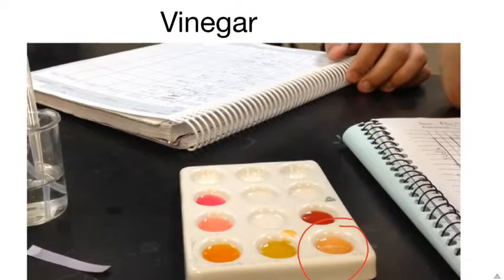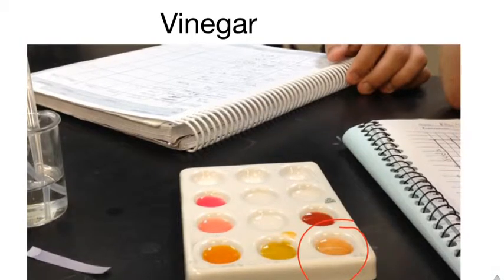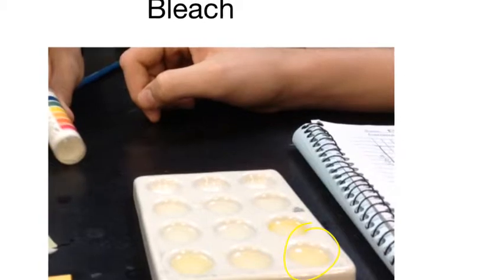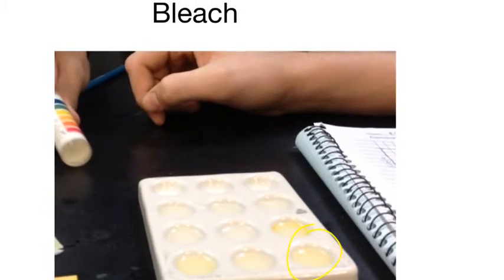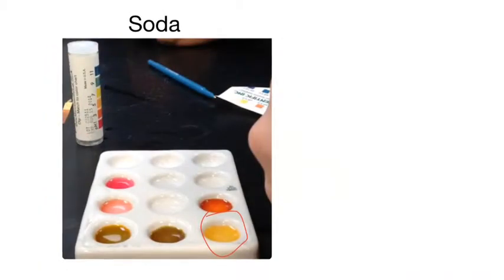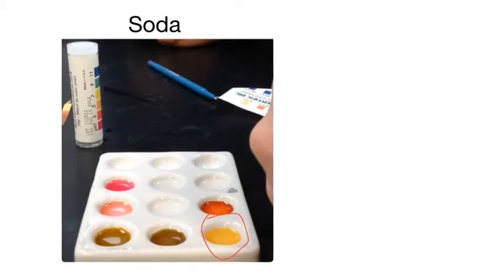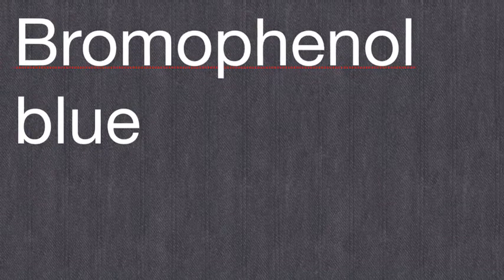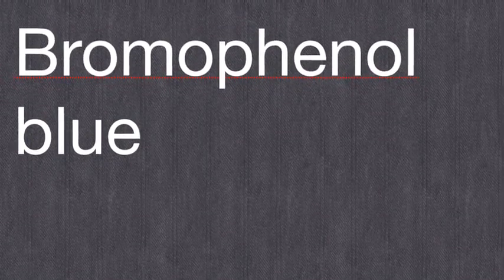When we put it into the vinegar, it was more orange-red on the red side, so it's an acid. When we put it into the bleach, it was very, very light yellow, so it's a base. And when we put it into the soda, it was more on the yellow side than red, so it's a base.